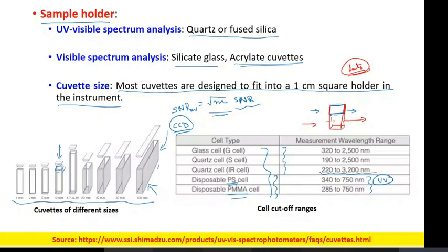That is why two of the sides are grounded, to make people understand that the other two regions should be put into the optical line of sight, LOS. And while holding, we have to hold the cuvette through the grounded sides.